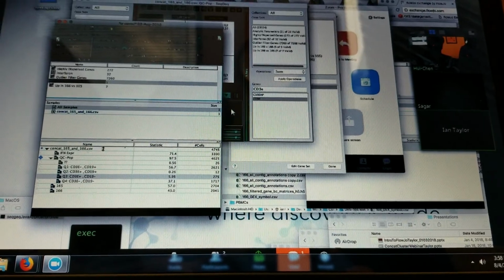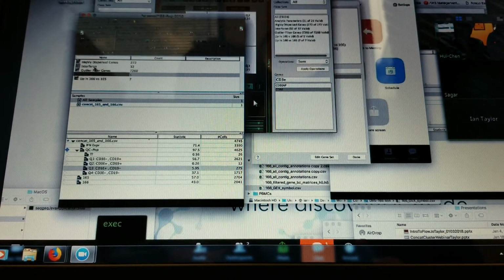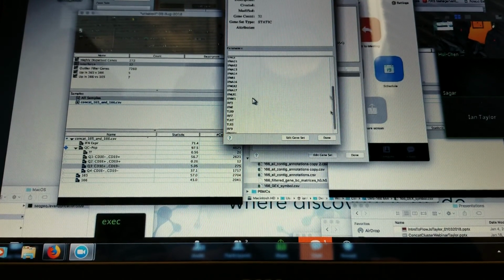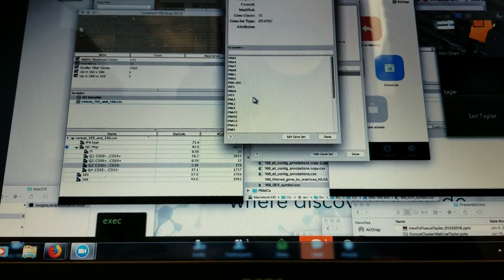You kind of learn to use that. Gene set inspector. So where's the inspector? Touch a gene, and then where's the inspector? I missed it. Oh, yeah, to get the inspector for a gene set, you'll double click on any gene set, and it'll open up that inspector that contains a list of all the genes in that gene set. Oh, okay, that's good.